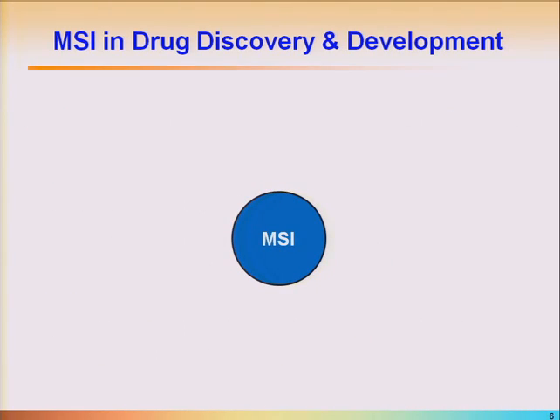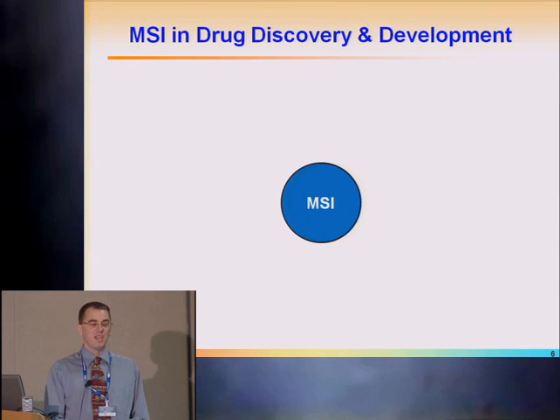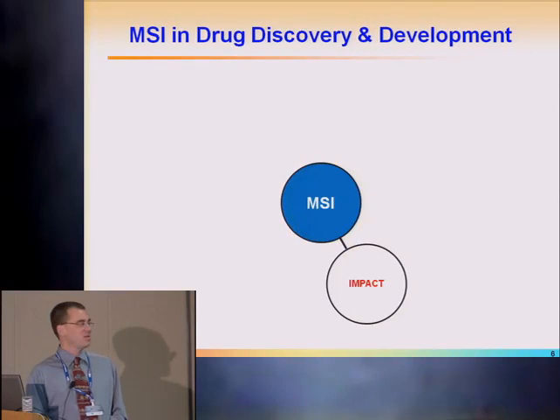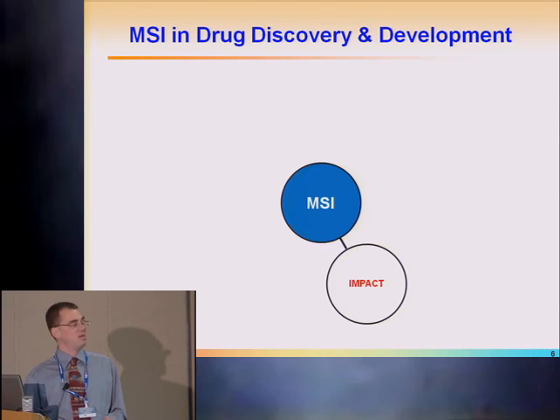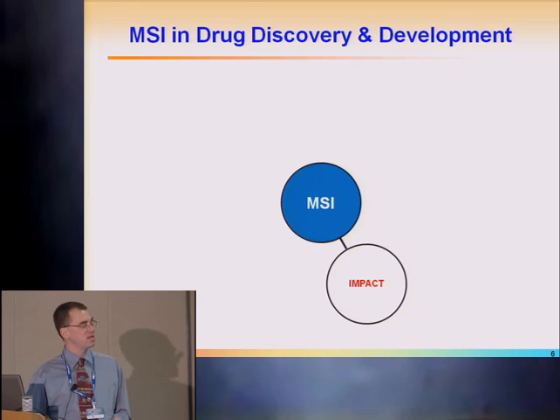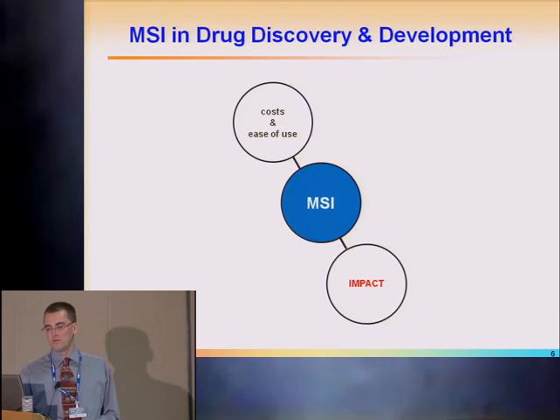So looking at MSI in drug discovery and development, the days are over where you just see an instrument and you buy it and you put it in your lab and you try to make it work. So what is the return on investment? When we bring MSI into the pharmaceutical industry, the first question is, what will be the impact? What will we get when we bring this technology in? What is the cost and what is the ease of use?